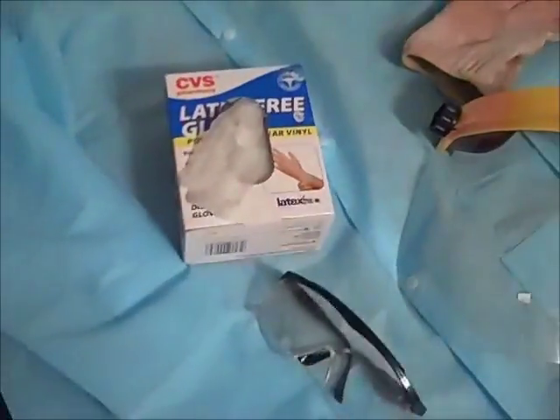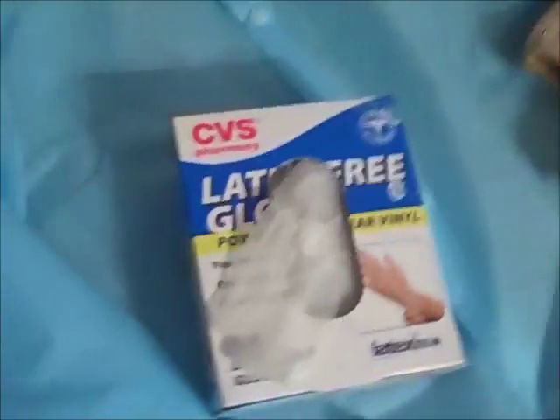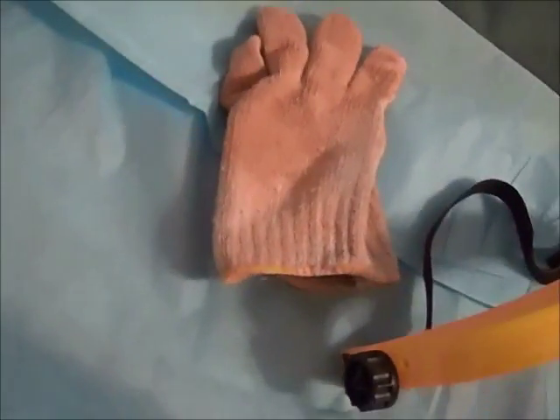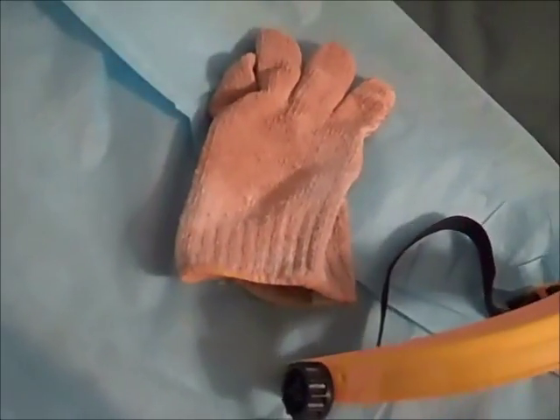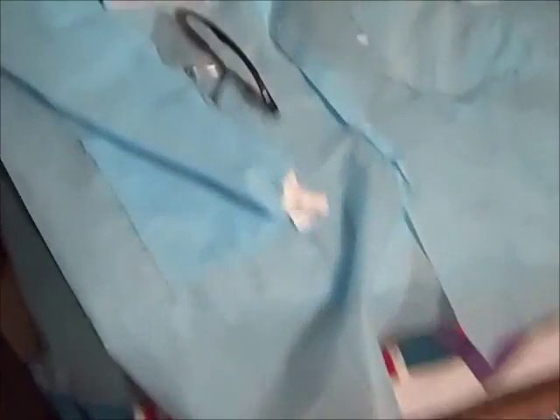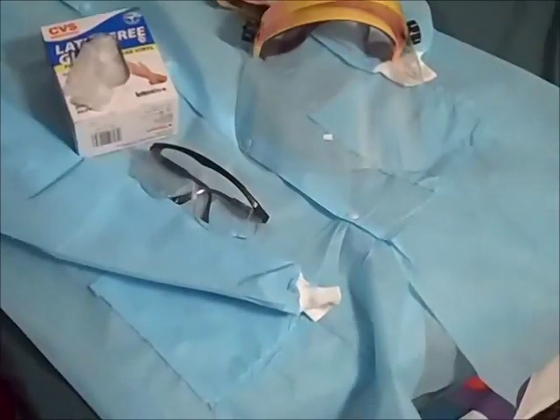Here are some safety gloves. Use these when you are dealing with a particularly dangerous chemical, like corrosive acid, etc. And this is a heat-resistant glove. If you need to take something that is really hot, like off of a hot plate or something, you can use these gloves to protect yourself. And of course there is my lab apron. I bought this from a biodiesel supplier. It didn't cost me too much and it is very worth wearing — it saves your clothing.